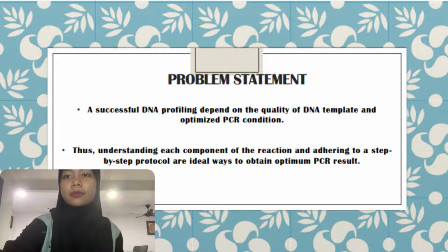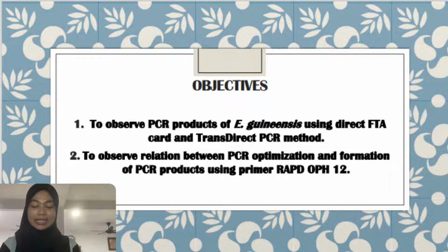result. The objectives in this study were to observe PCR products of Elaeis guineensis using direct FTA card and transdirect PCR method, and to observe the relation between PCR optimization and formation of PCR products using primer RAPD-OPH12.